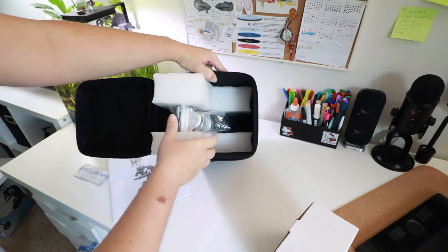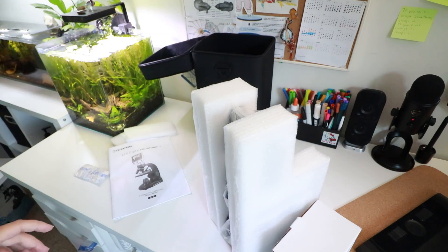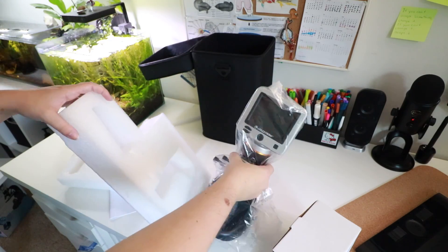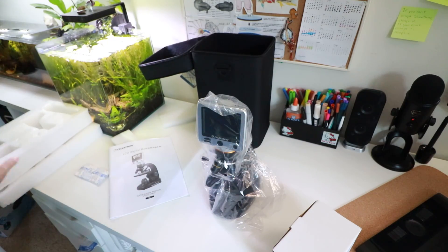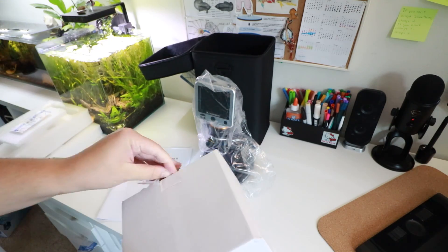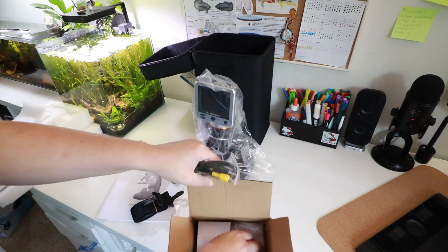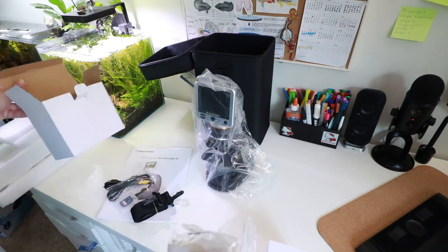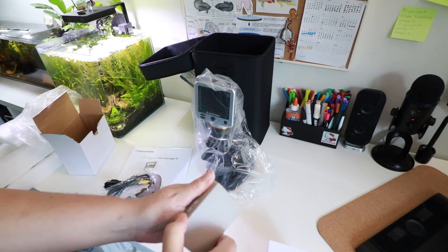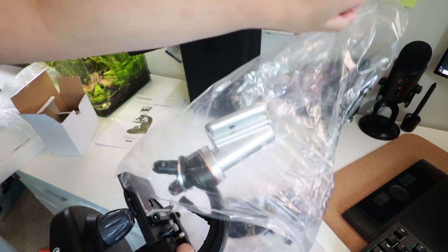I'm just excited overall — I've never had a microscope. I feel like a fancy scientist and I'm stepping up my game as a fish keeper. I will also have an Amazon affiliate link down below if you would like to purchase the same microscope, as well as the link to Dr. Eric Johnson's tutorial. One of the cool things about this microscope is it comes with different outlet plugs, so if you are overseas in Europe or in North America, you don't have to worry about getting an adapter. It also comes with some sample slides, a slip cover, a memory card, and some cables to connect it to a screen.